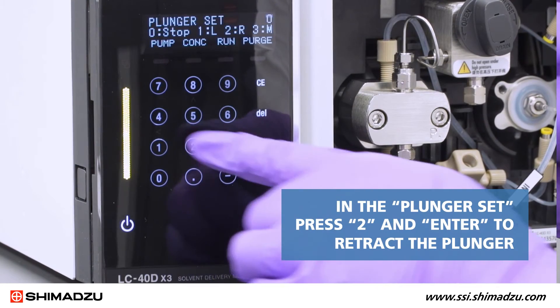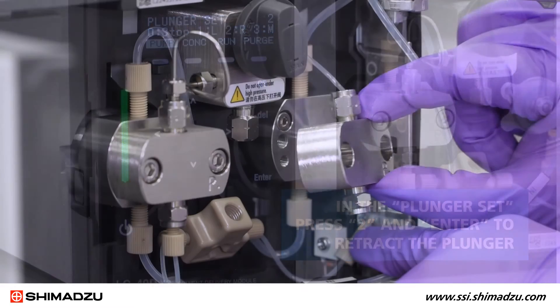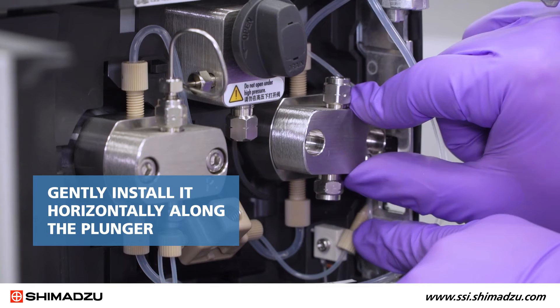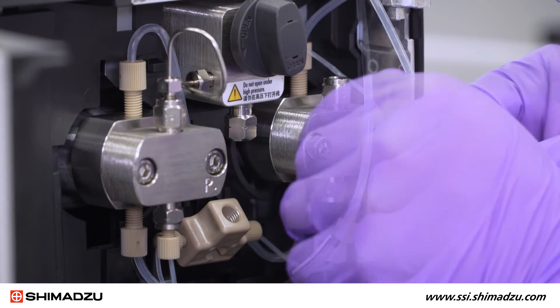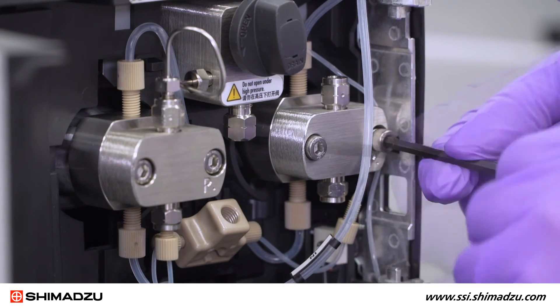In the Plunger Set, press 2 and Enter to retract the plunger. To reattach the pump head, hold it with the letter P at the bottom right, then gently install it horizontally along the plunger. Insert the two hexagonal socket screws and tighten with the M5 Allen wrench, alternating between the left and right screws.